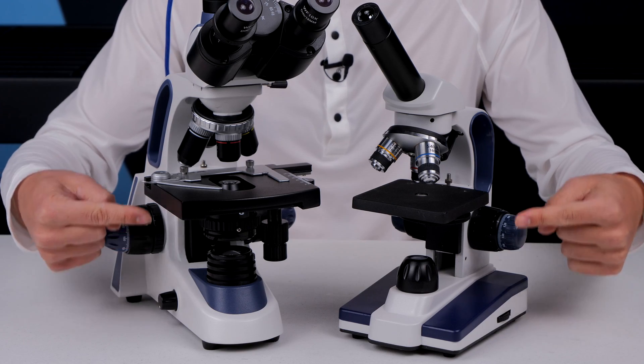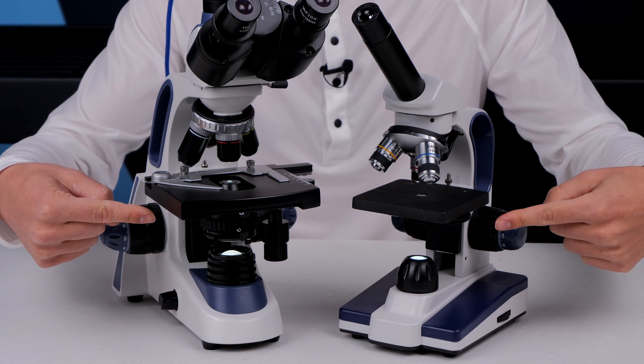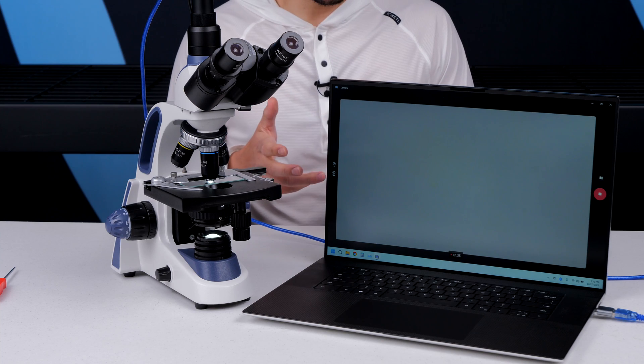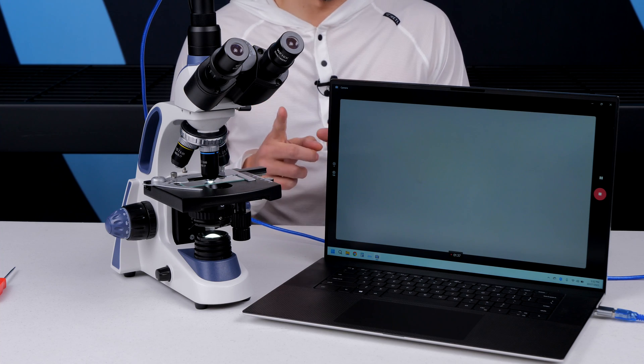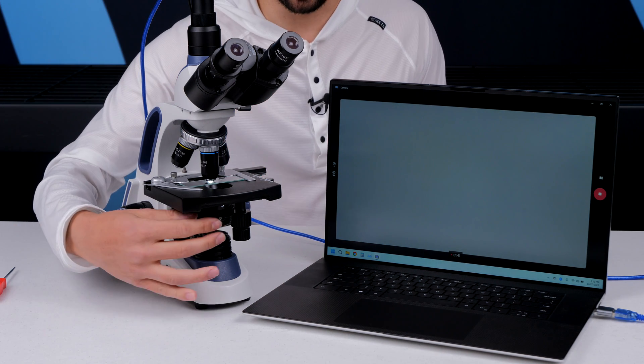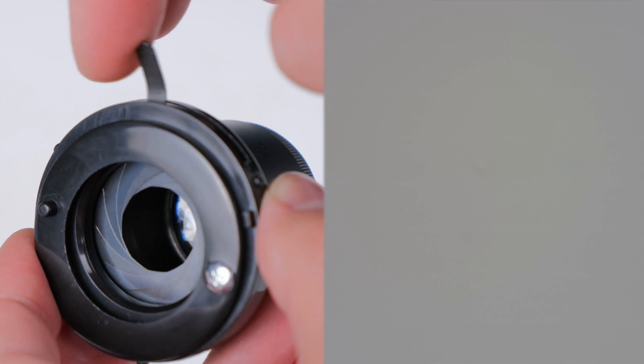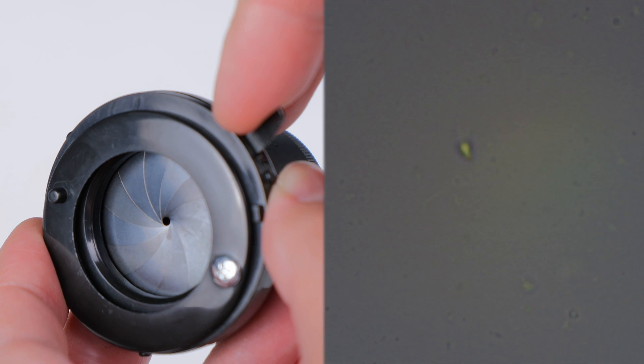You'll need a standard transmitted brightfield light source with or without a condenser. The angle that the light hits a sample is really important here because sperm are almost completely invisible, so you need to crank up the contrast between the sample and the background. You do that by closing down the iris on the condenser.